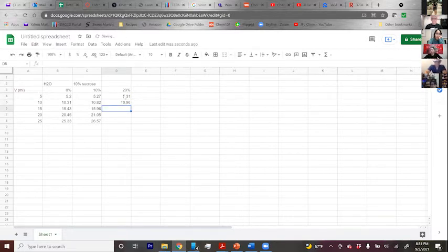And then 16.6. It was 16.60, but if I put the 0 in, the computer automatically spits it out, so it won't affect the calculation. 22.23 and 27.34.